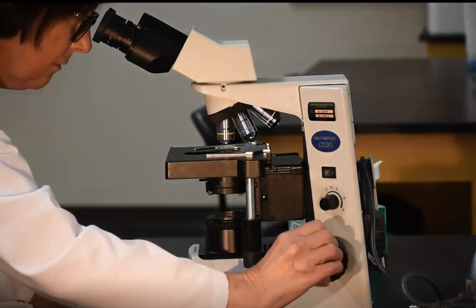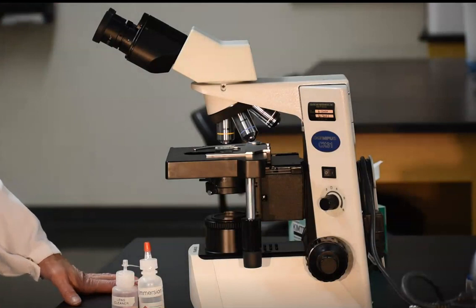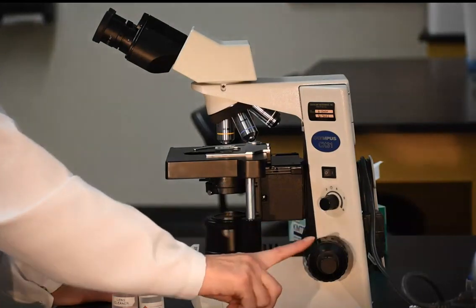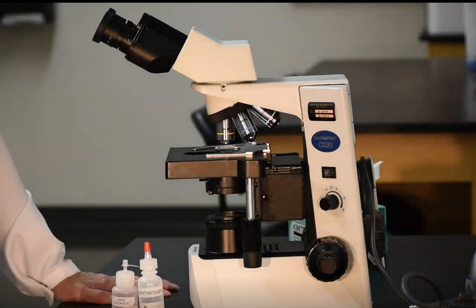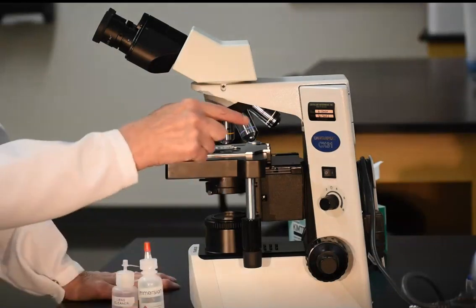Microscopes are designed so that all the lenses have close to the same focal distance. Once the specimen is in focus with one lens, only fine adjustments will be needed to bring the object back into focus with another lens. Because the working distance is decreasing with each increase in magnification, we only use the coarse focus with the first lens and the fine focus for the following lenses. If you use the coarse focus with high-powered lens, you risk smashing the slide and scratching the lens. This can be a costly error.